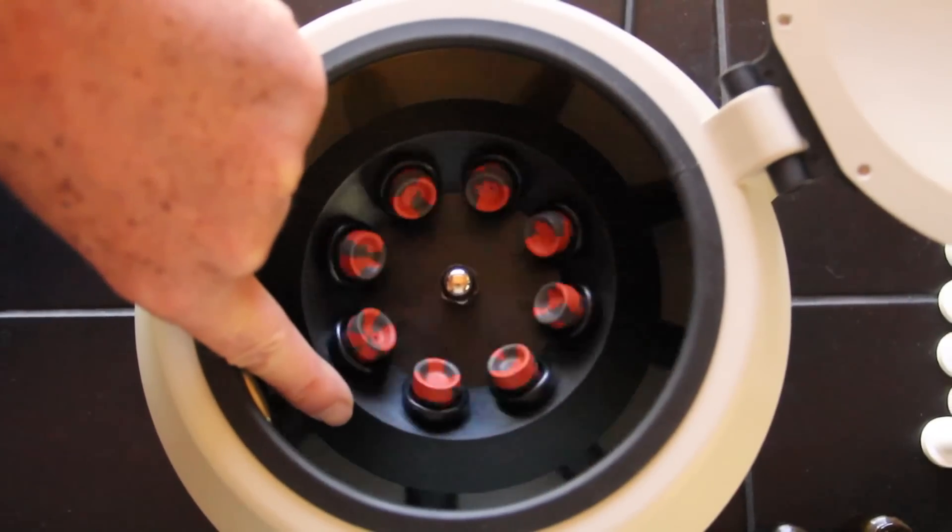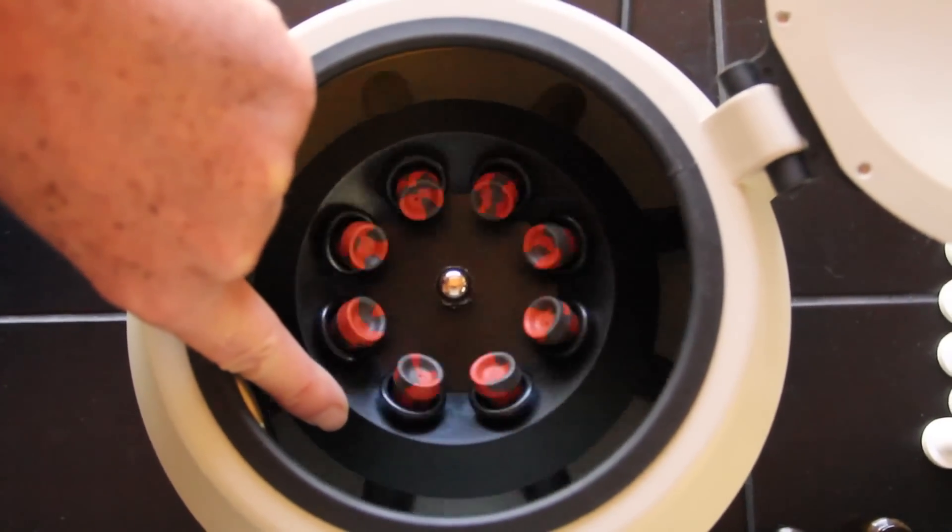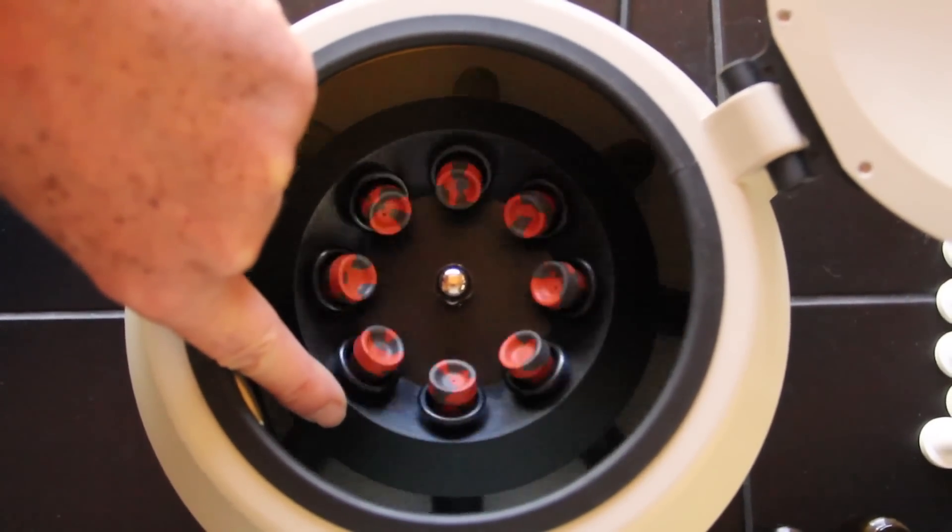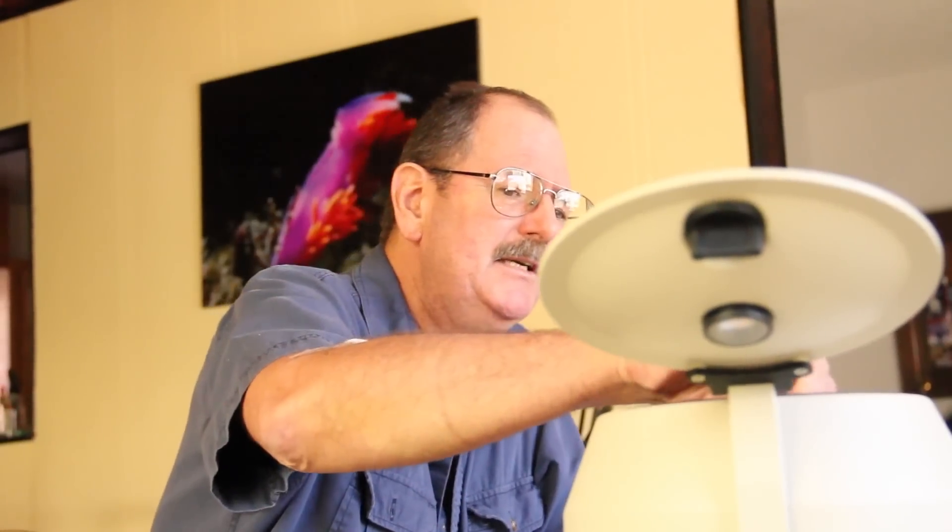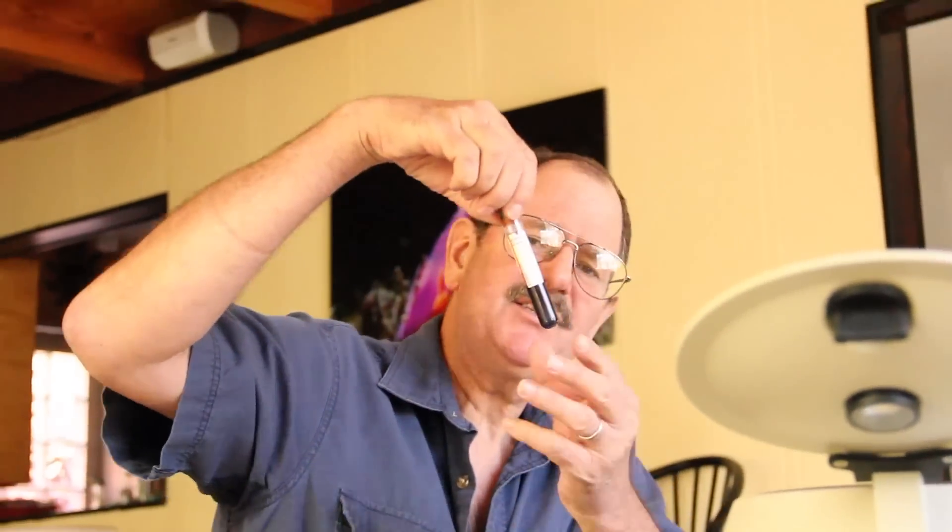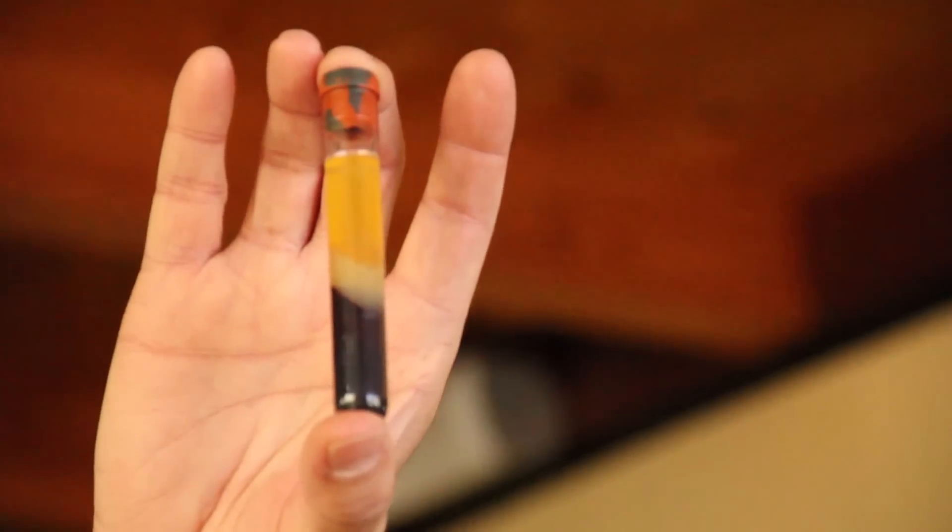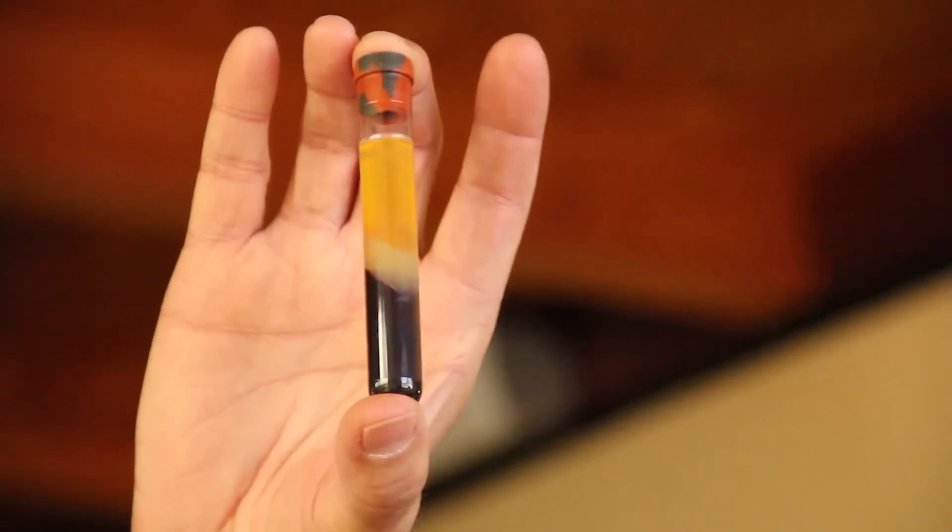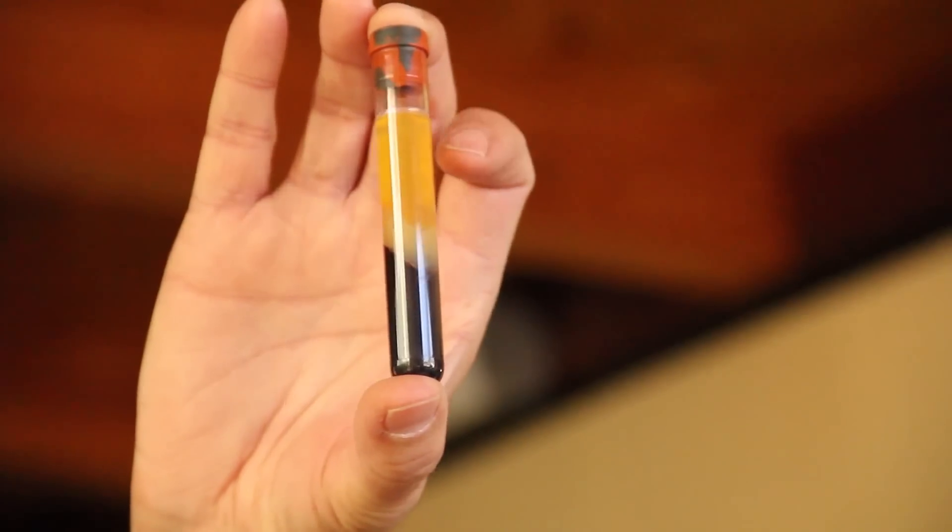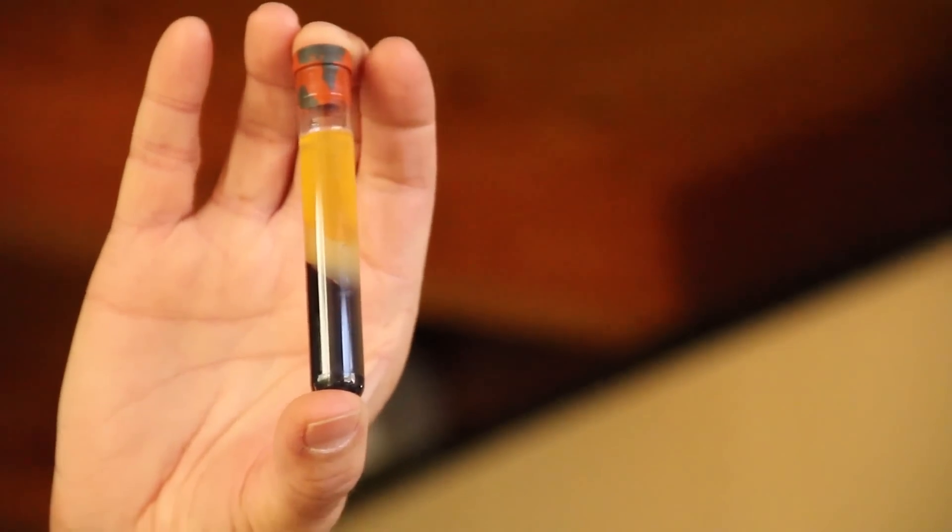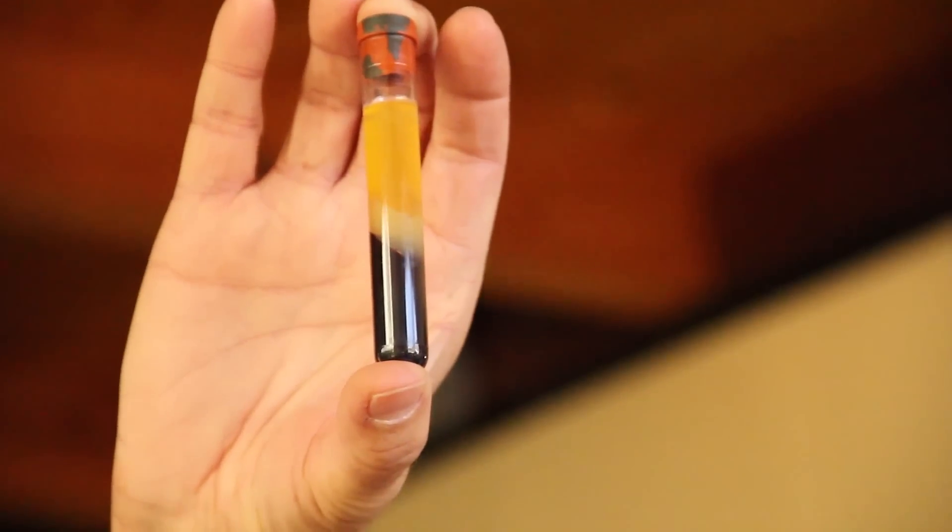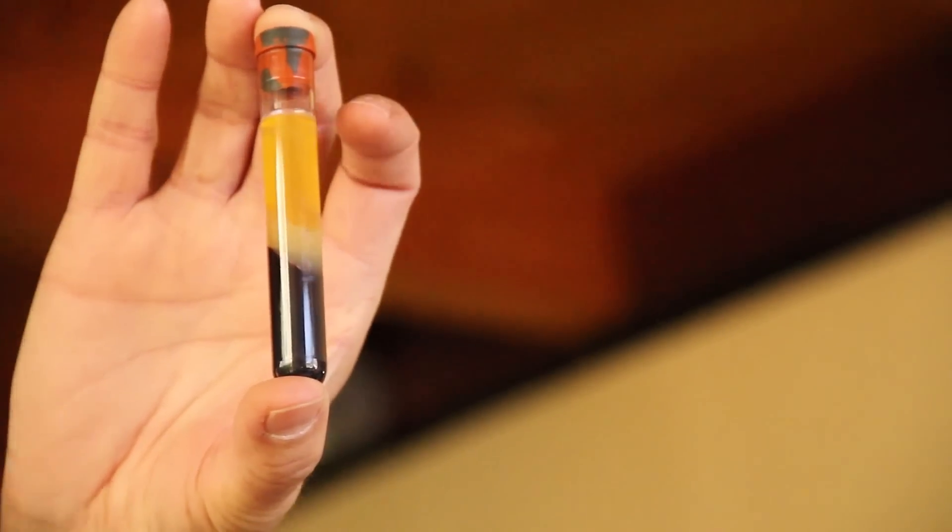Okay, it's been about 30 minutes in the centrifuge and we're ready to do the pour. As you can see, the red cells have gone to the bottom of each tube and the amber serum has risen to the top. There's about a teaspoon of serum there, and what I'm going to do is pour half of that into a bottle and the other half into a separate bottle.